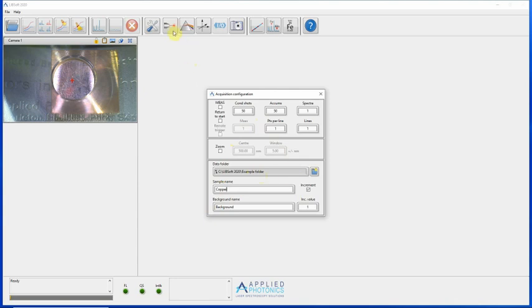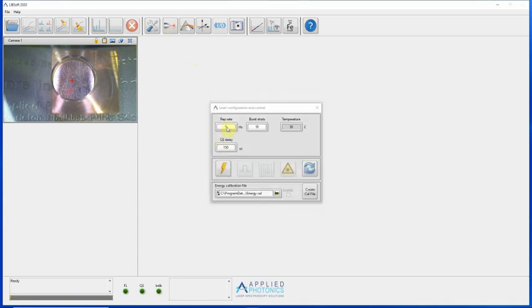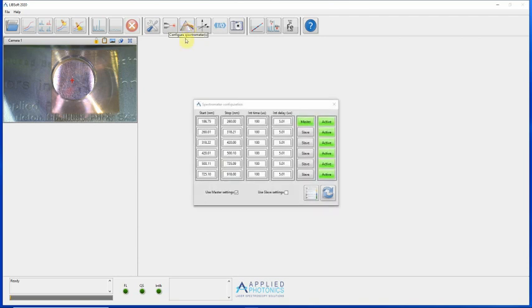Now if we set the laser configuration, we'll use an acquisition rep rate of 5 Hz and a Q-switch delay of 150 microseconds, which for this laser equates to approximately 50 millijoules of energy. And then finally we'll configure the spectrometers. We'll set an integration delay of approximately 3 microseconds, and we'll change the integration time to 30 microseconds.